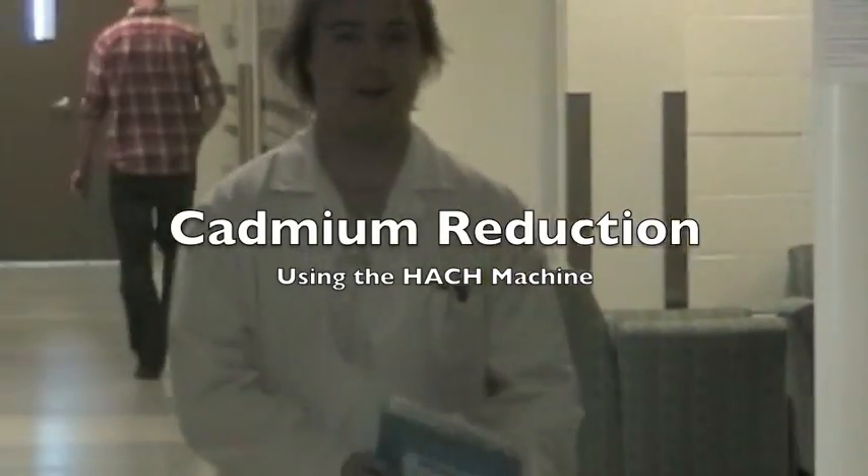Today we'll be outlining the SOP for the nitrate cadmium reduction method and the necessary components for the HACH DR 2010 spectrophotometer.